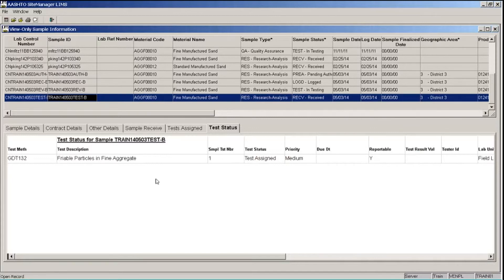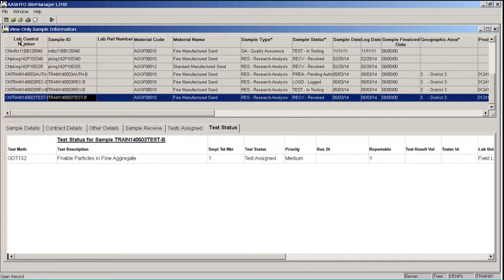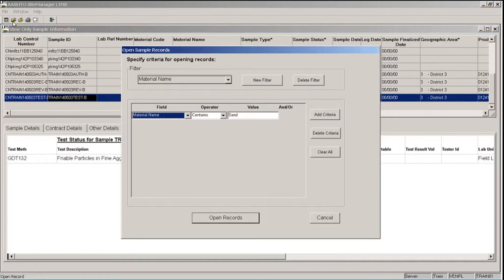So I've finished looking at the test and sample information that I want to for now, and I want to go back and clear my filter criteria. So I'm going to click the Open button on the toolbar, which brings up my Open Sample Records window.